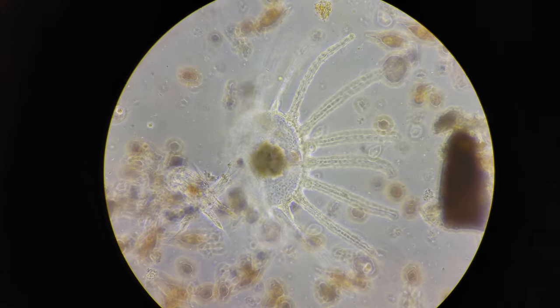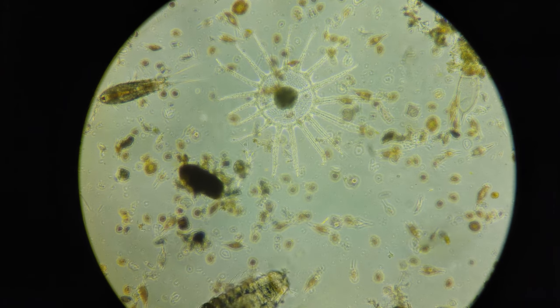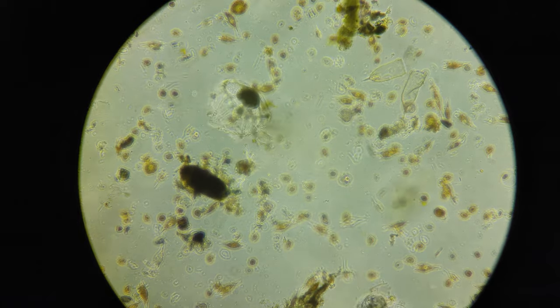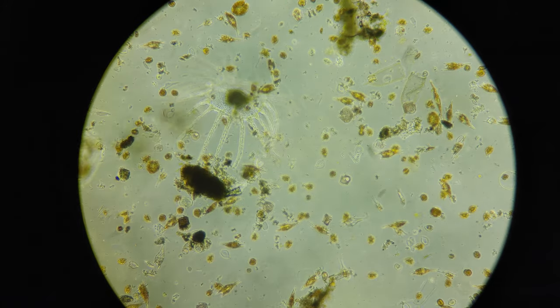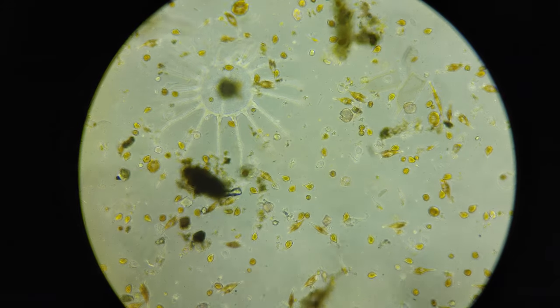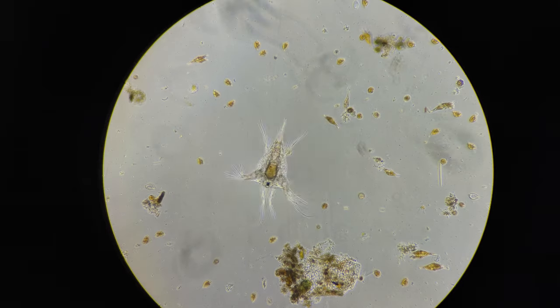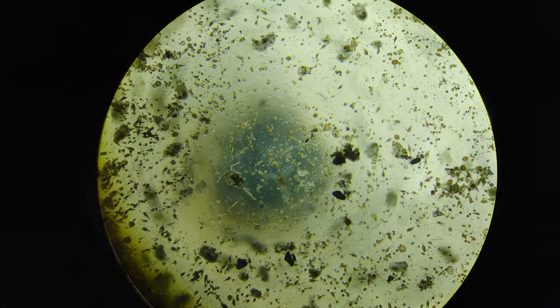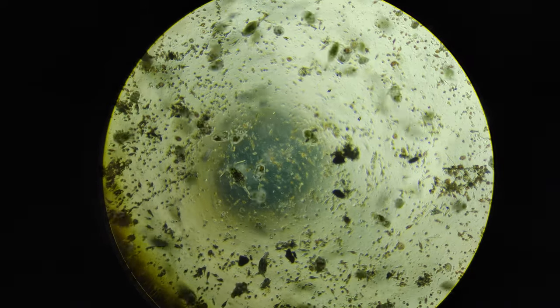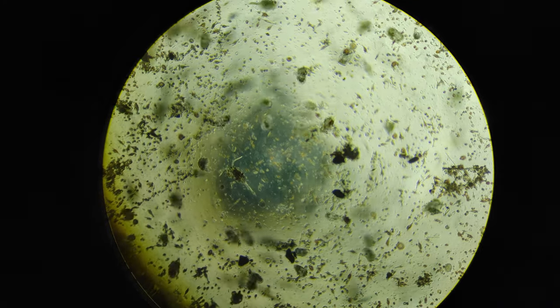This creature that looks like a tiny jellyfish I believe is actually a hydrozoan, which is related to jellyfish. Both jellyfish and hydrozoans have a free-swimming form that looks like this — it's called a medusa. The most well-known hydrozoan is the Portuguese man of war. This here is a copepod. There are tens of thousands of species of copepods with all different body shapes. You can really start seeing the scale of the plankton in the sample, from the amphipods to the worms to the copepods and even the nanoplankton.